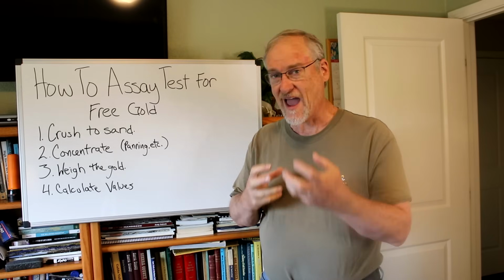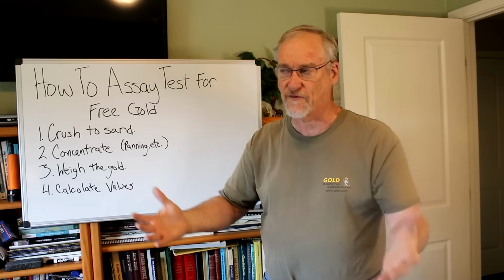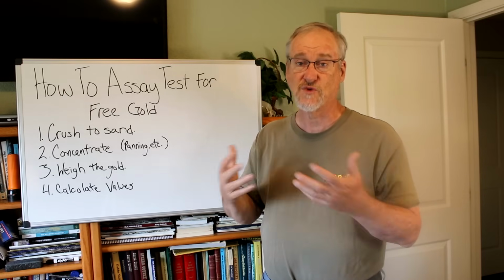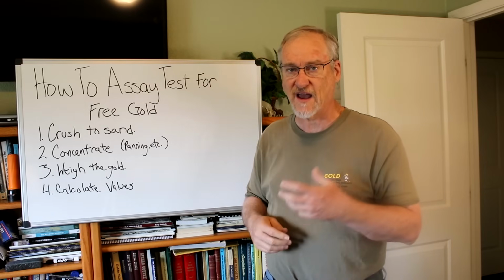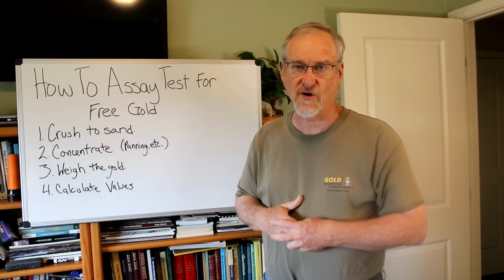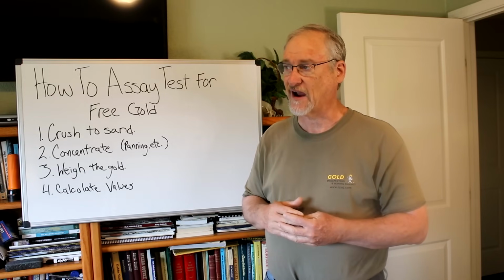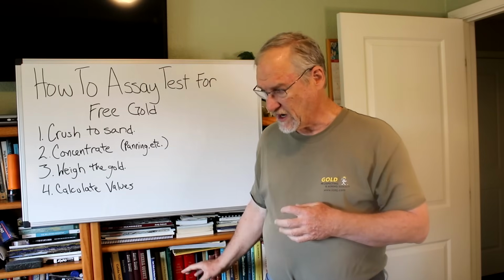So having a large sample gives you a more accurate, more reflective type of result that tells you really what you have in this rock. You could be sampling old mine dumps or a vein someplace or something like that. You want to have a good number for the average typical amount of gold in that rock, and that makes perfect sense. So we're going to go through that.